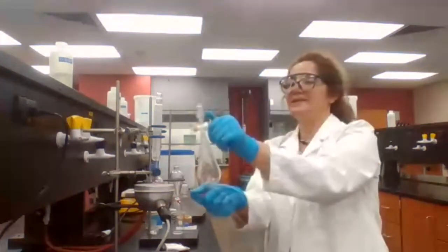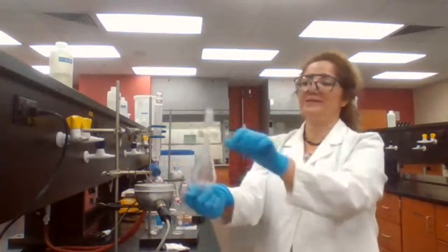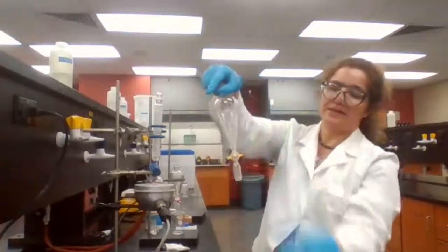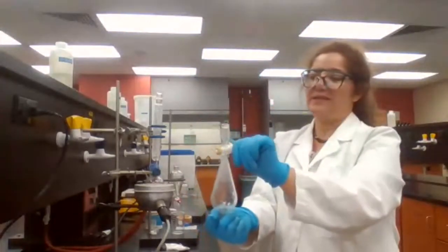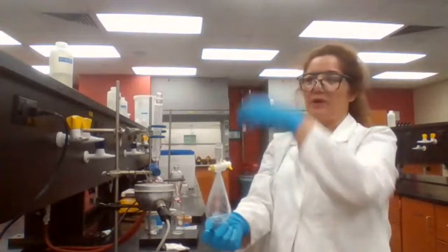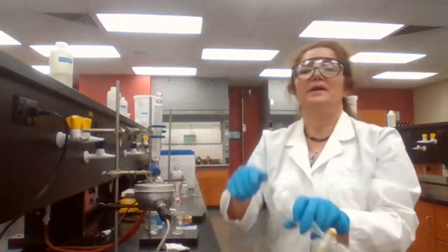Also, when you vent it, you open the stopcock to vent the vapor or the gas. If you forget to close it before you put it in the top upright position, the chemicals are going to spill everywhere. So you have to be careful with this part also. You vent it, you put it back. It's just like the burette that you were using. You want to close the stopcock before you put any chemicals in. And this has to be greased, otherwise it won't be sealed.